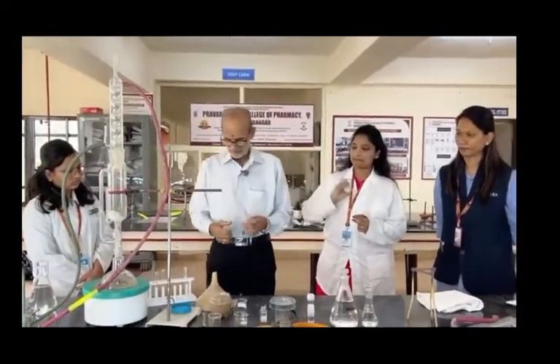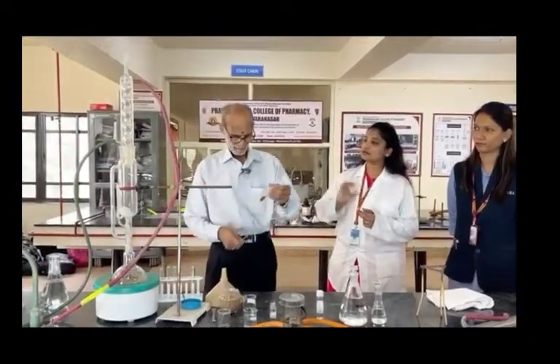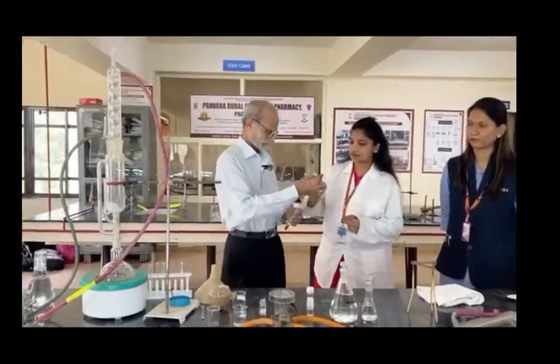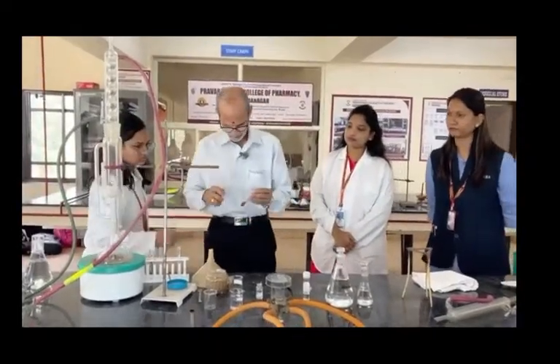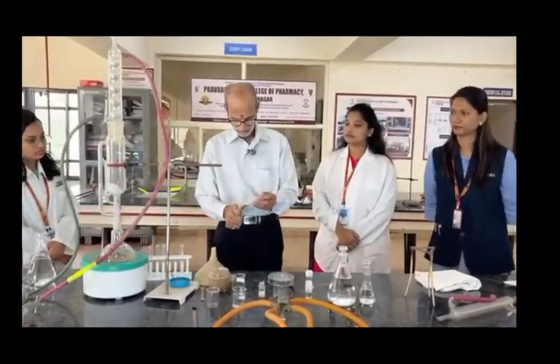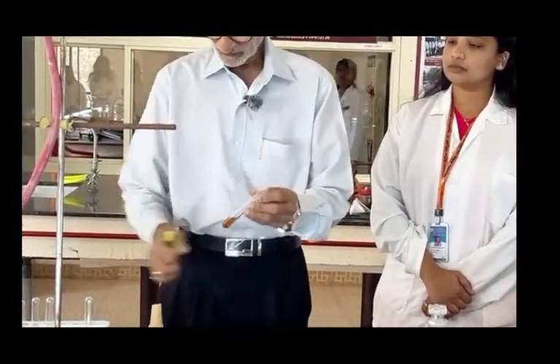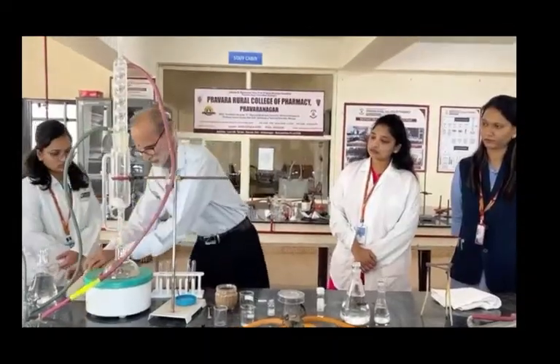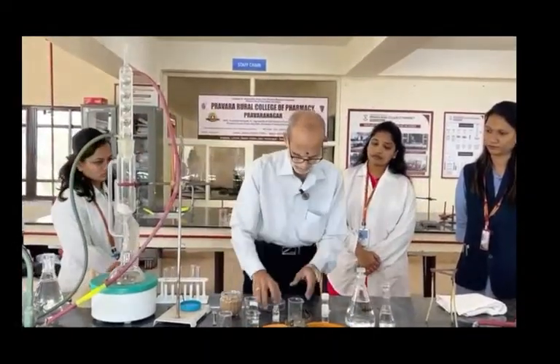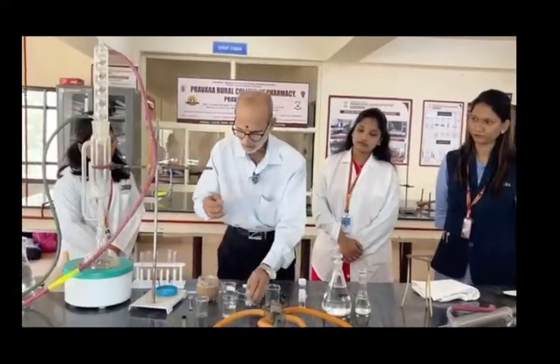So here we are going to use thin layer chromatography to see whether embelin is present in the raw material which we are going to separate for extraction. We have a pure embelin standard, against which we took the extract: 1 gram of Embelia powder, to which methanol was added and heated. So the standard and the test extract are ready, and we are going to use them for the development of the TLC.